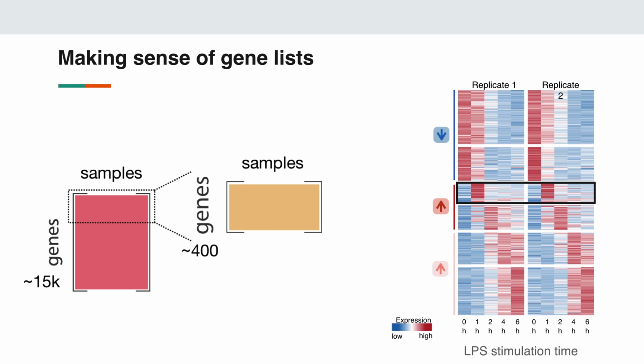So, after the entire process that you just went through of mapping your sequence reads, quantifying them for each gene, and discovering the expression level in each of your samples, you have this full set of gene expression data, which you even took further and performed, for example, a differential expression analysis, and this reduced the list of 15,000 expressed genes to, let's say, a group of 400 genes for which you saw an upregulation in your experiment with respect to your controls.